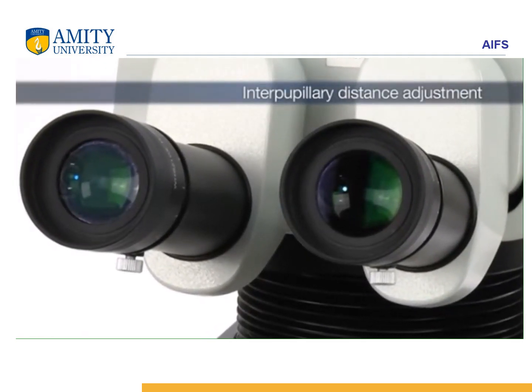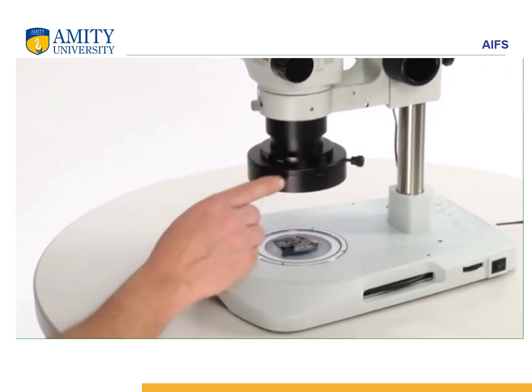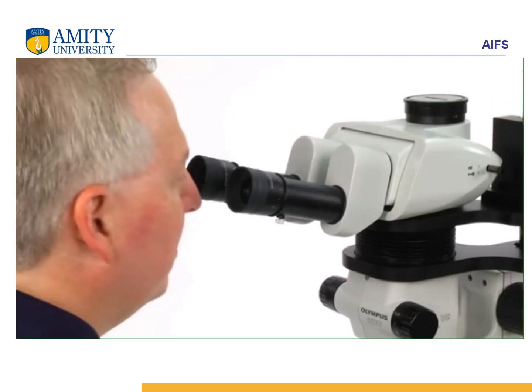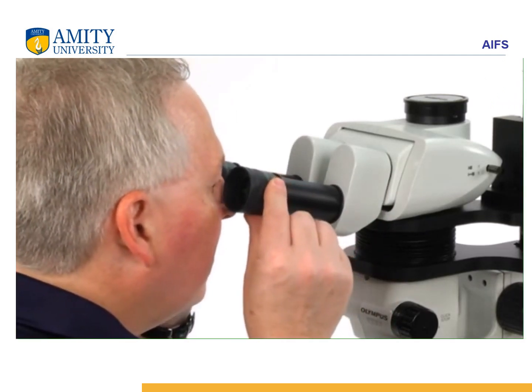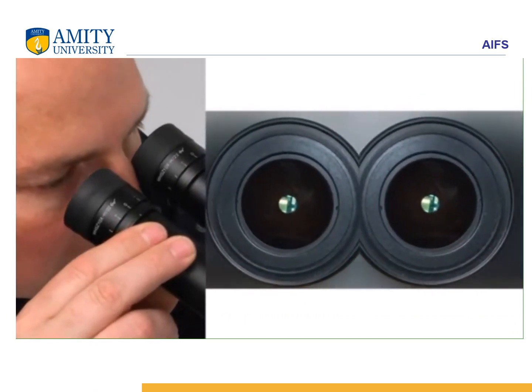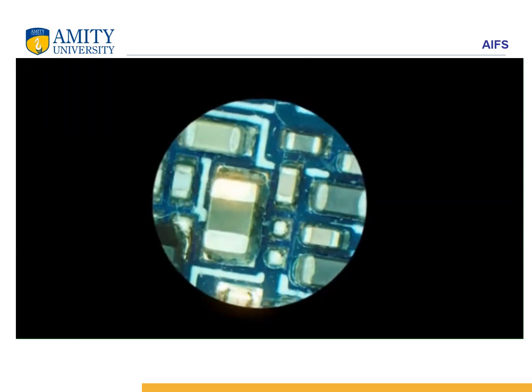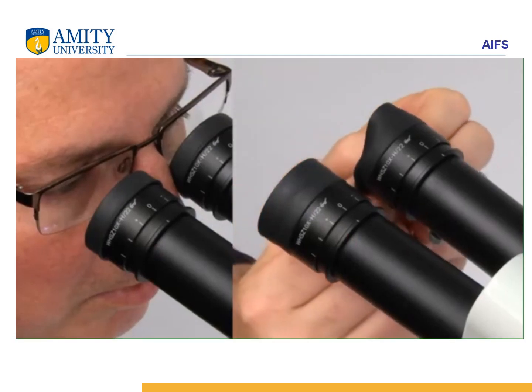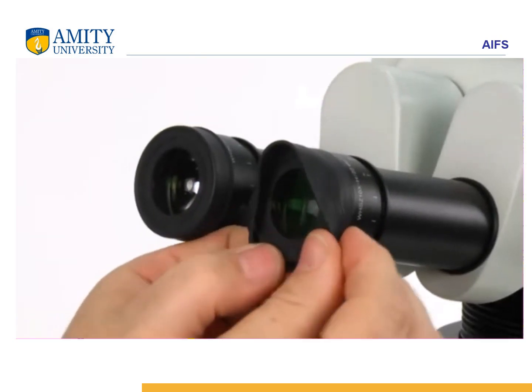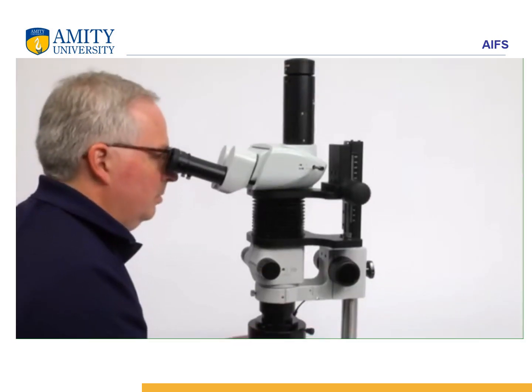This is interpupillary distance adjustment. The specimen is now placed here, and the magnification and clarity are being adjusted. See, this is the view you get in a stereo microscope, and as we have already discussed, it gives you a three-dimensional image.